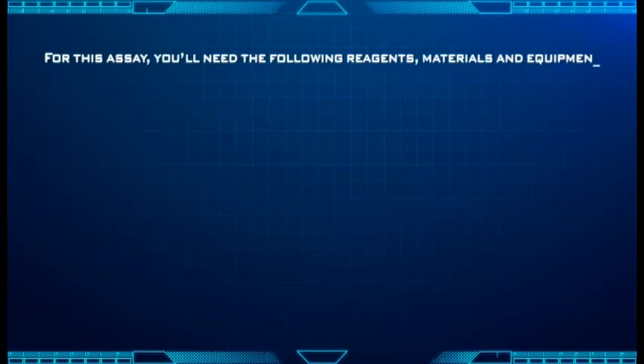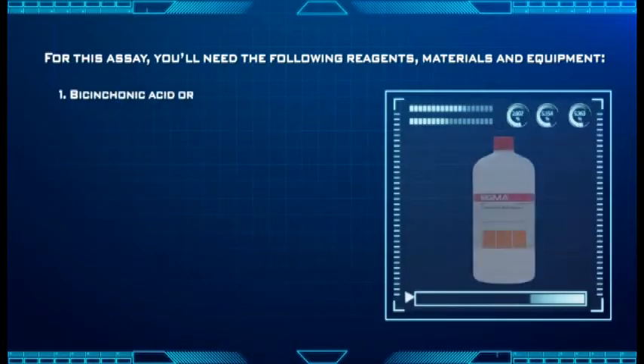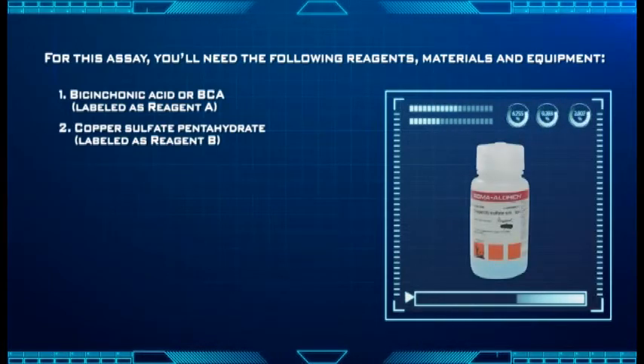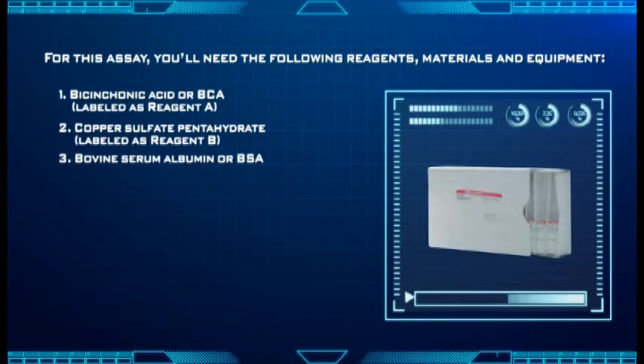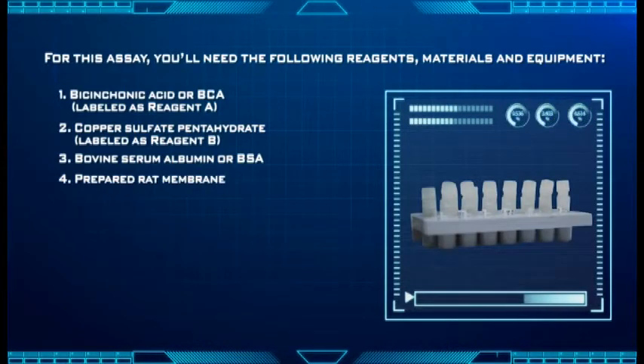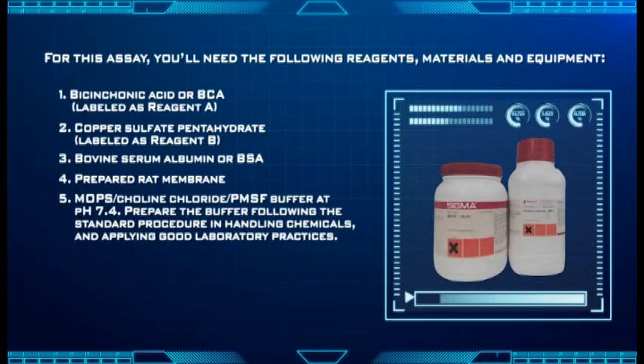For this assay, you'll need the following reagents, materials, and equipment: bicinchoninic acid (BCA), labeled as Reagent A; copper sulfate pentahydrate, labeled as Reagent B; bovine serum albumin (BSA); prepared rat membrane; and MOPS Choline Chloride PMSF Buffer at pH 7.4. Prepare the buffer following the standard procedure in handling chemicals and applying good laboratory practice.